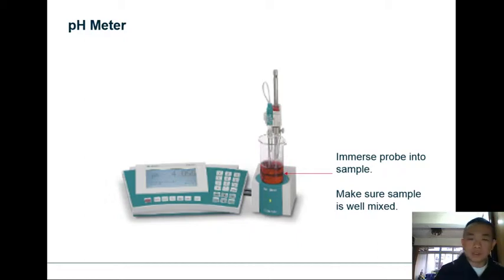Now as always, when you're doing any analysis, make sure your sample is well mixed before taking the reading, because if it's not well mixed, then you might have some inaccuracies when you're taking the pH of your sample.